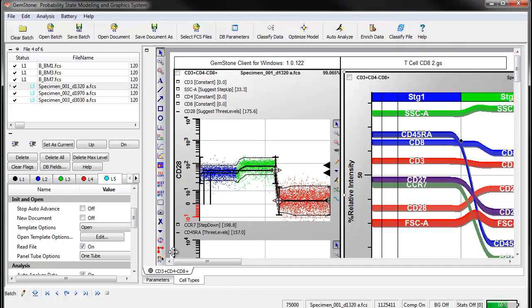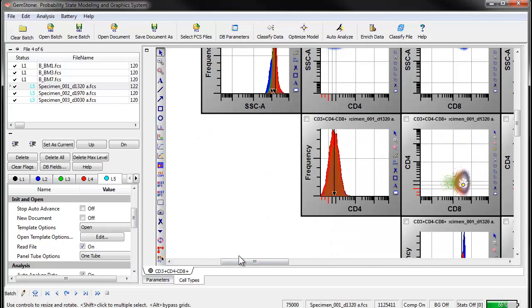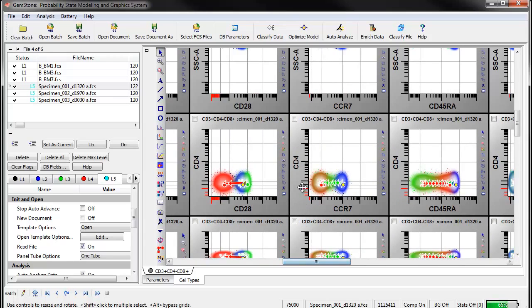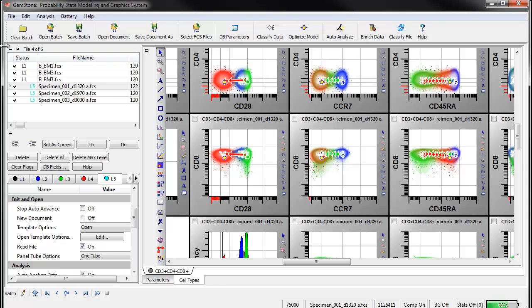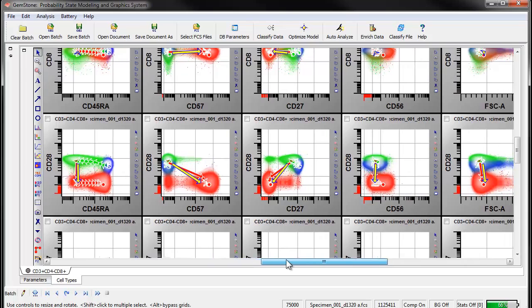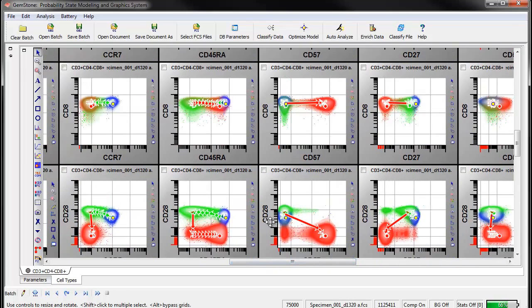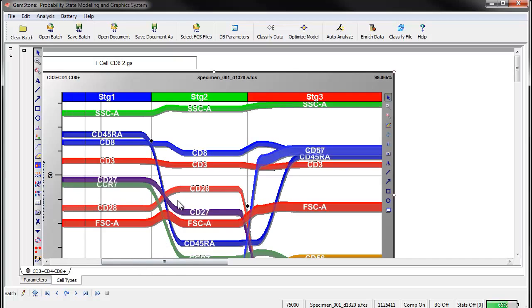And then normally I turn on the animation just so you can see all these distributions, both with color and with motion. There's a lot of plots there. A lot of plots, and the important thing is that all the information in all those other dot plots is being shown to us in our overlay.